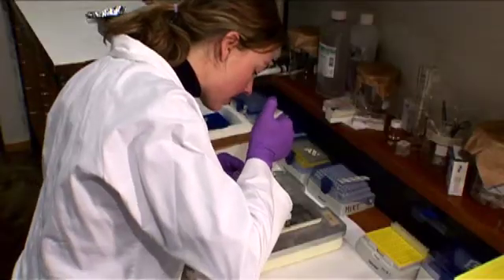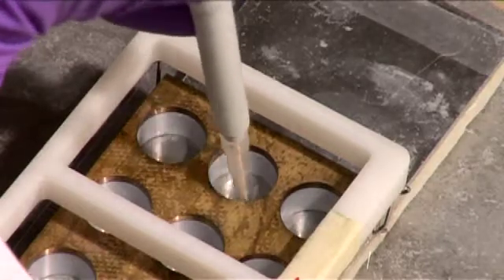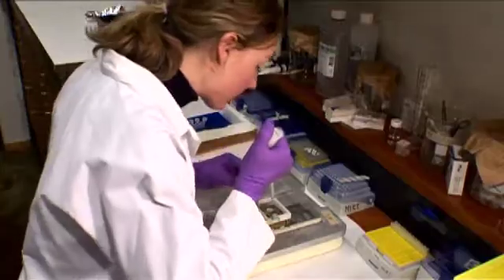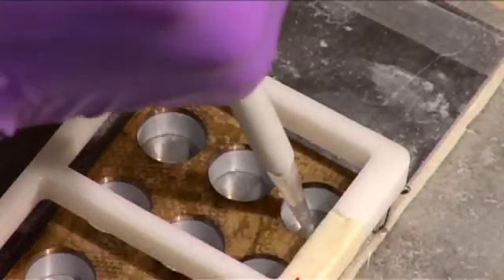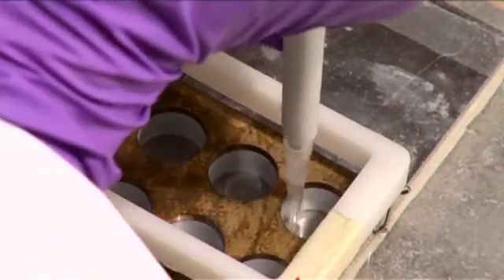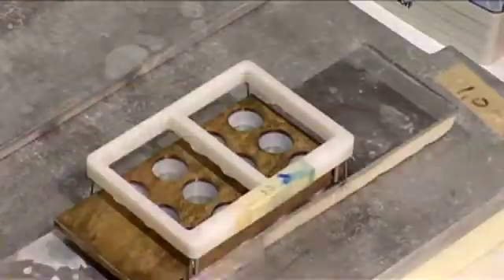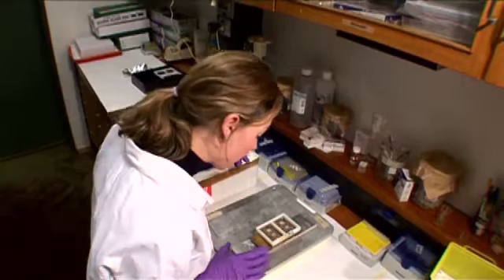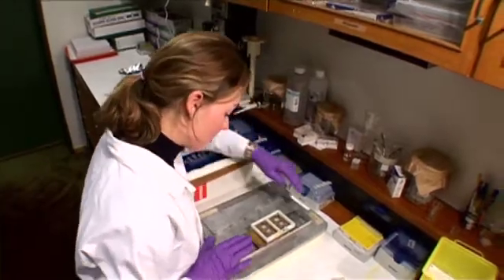And these wells have Teflon lining, which makes the gel even in the well there. And the agarose will solidify quite quickly on this cold plate.